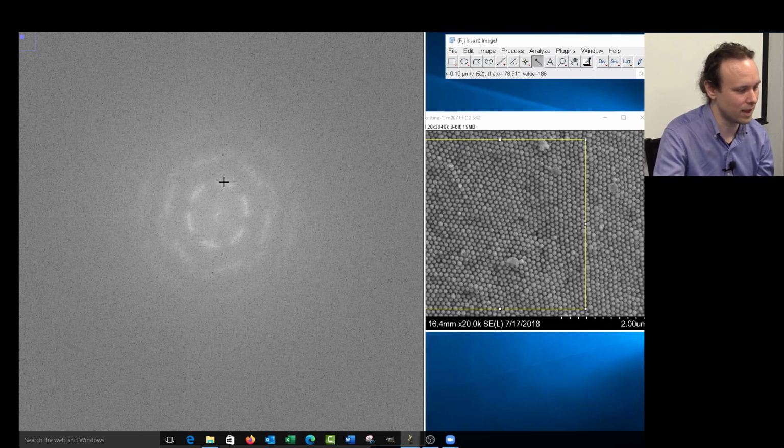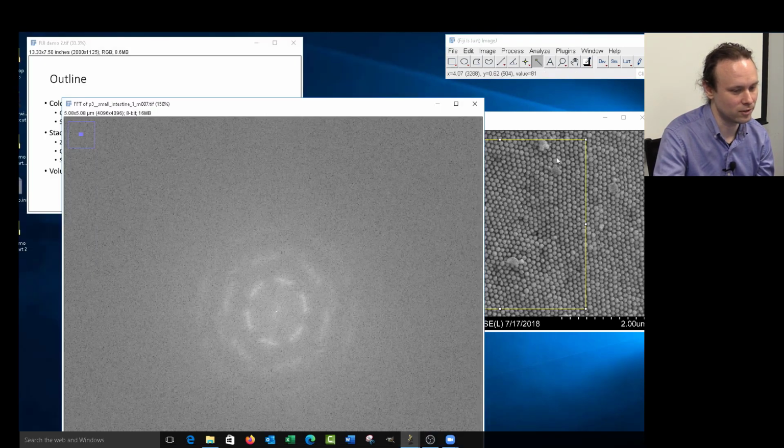That's the spatial frequency, essentially 100 nanometers. And as we go out, it'll go down. Each of these represents a spatial frequency common to this image. These spatial frequencies in the center represent the actual microvilli, and these other ones are the gaps between microvilli. So it's a quick way of quantifying things that have very consistent features.